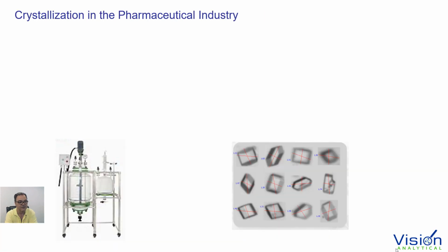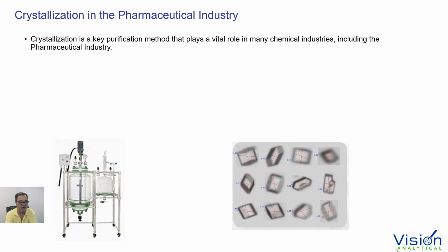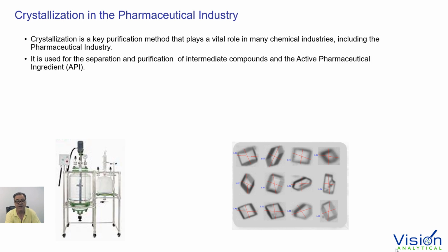So I'm sure this is very well known by the audience, being that this is a pharmaceutical conference. But just to give a slight little overview, crystallization is a process for purification. It's used in many, many different chemical industries, and it is definitely used quite a bit in the pharmaceutical industry, primarily for the separation and purification of APIs.